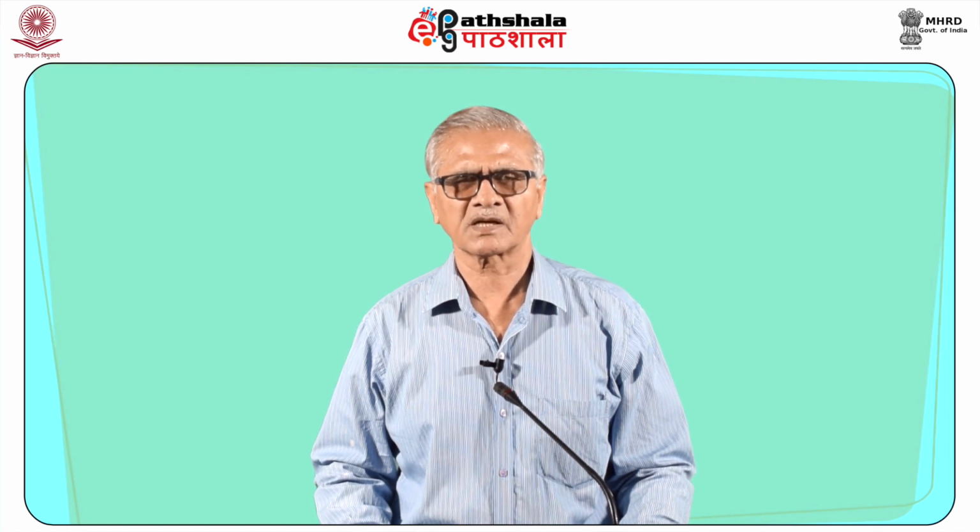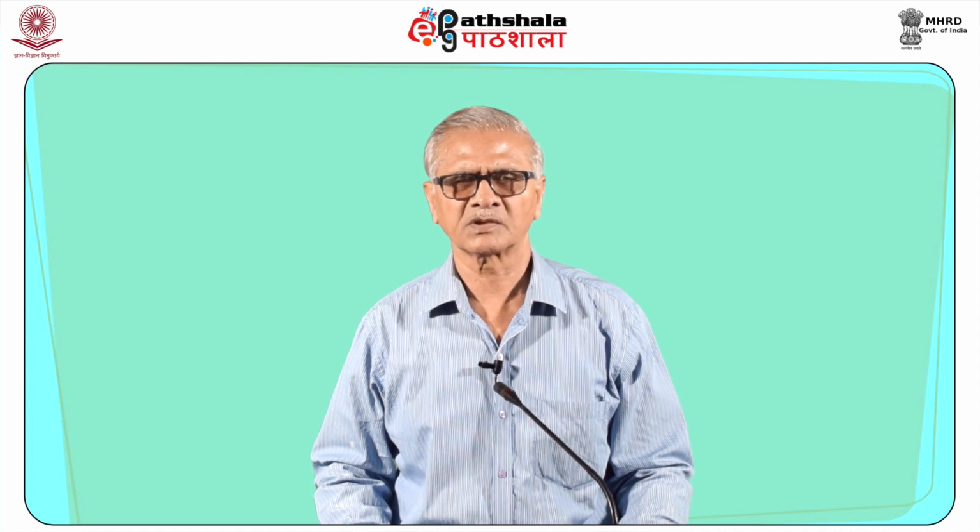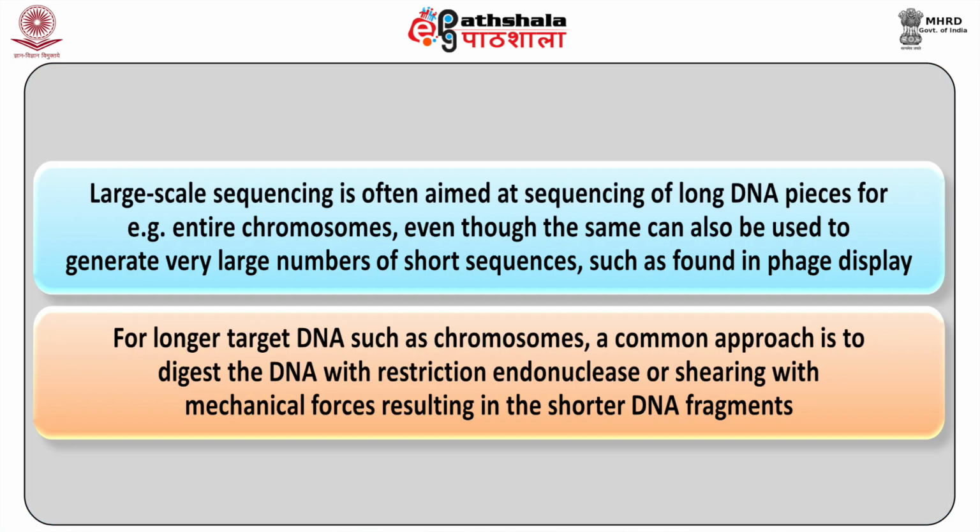Millions of DNA strands are sequenced in parallel, yielding significantly higher throughput and minimizing the need for fragment cloning methods that are required for Sanger sequencing of genomes. Large scale sequencing is often aimed at sequencing long DNA pieces, for example, an entire chromosome, even though the same can also be used to generate a very large number of short sequences, such as found in phage display.